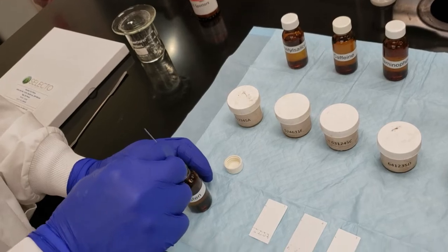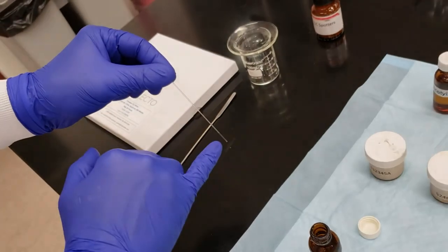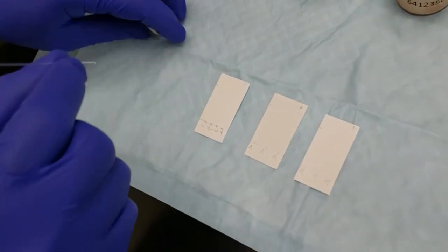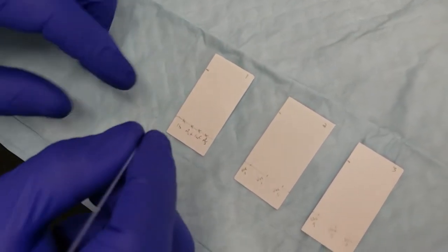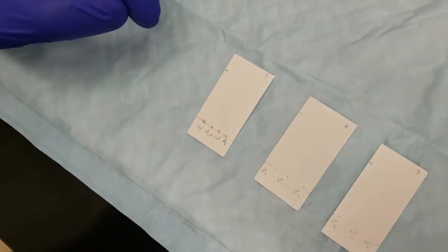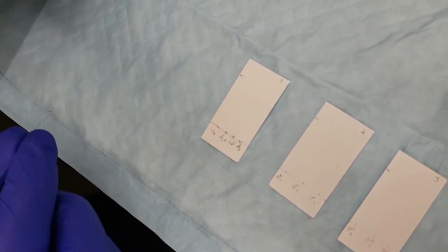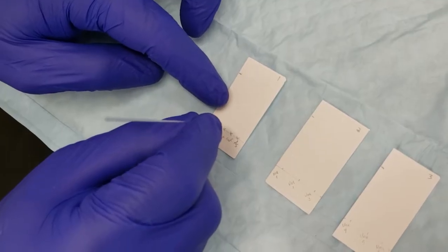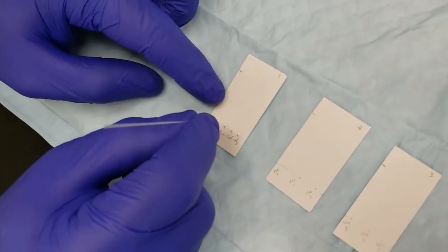And I'm just going to put that capillary into our solution. Maybe if we do it against the black background, can we see our capillary action here? This is our solution. Now the way that I'm going to spot this, I'm going to spot directly on top of my X. I'm going to spot just for a second, and then I'm going to let up. If I were to keep the capillary in contact with the silica gel, then that spot would spread out to a very wide diameter, and we don't want to do that. We want to keep our solution, and more importantly, the compound dissolved in the solution, in a tight spot right on that X. So we do a spot, then release, and we can blow on the plate to help that solvent evaporate. Then we'll do another spot.